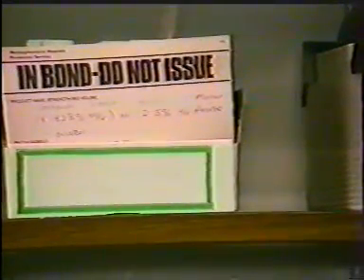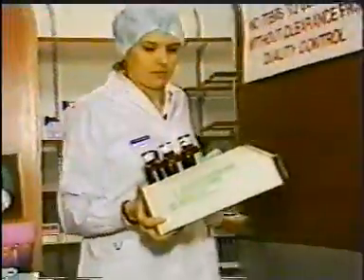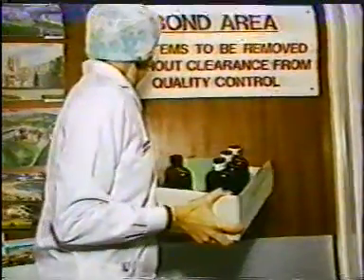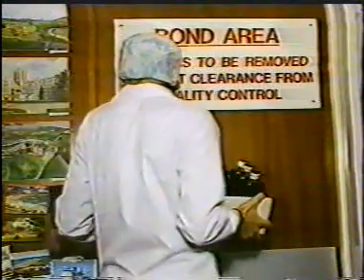Because of the length of time required for incubation in the sterility test, sterile products will need to be held in bond for at least 1 and sometimes 2 weeks. They must therefore be made well in advance of being needed.